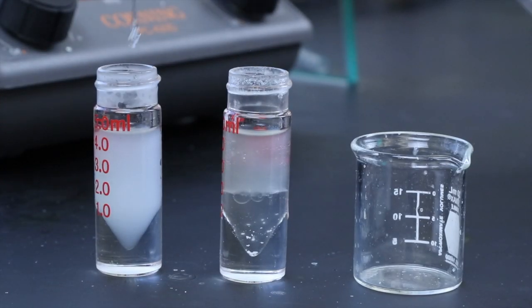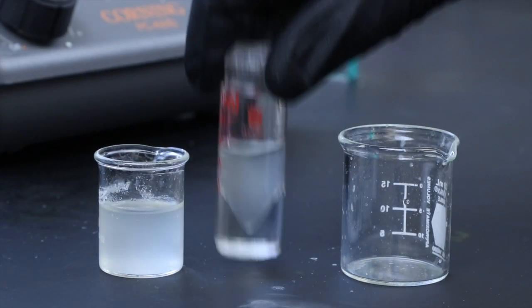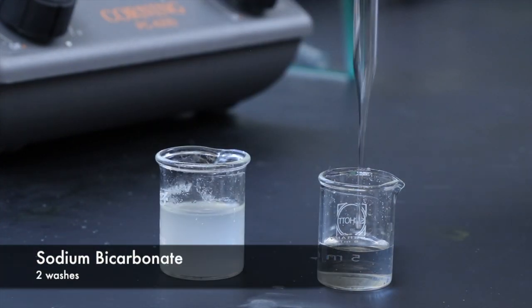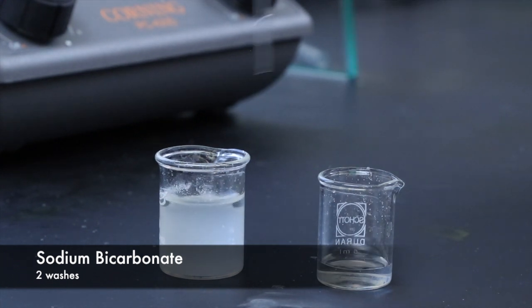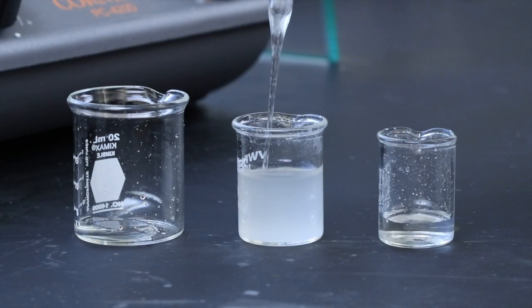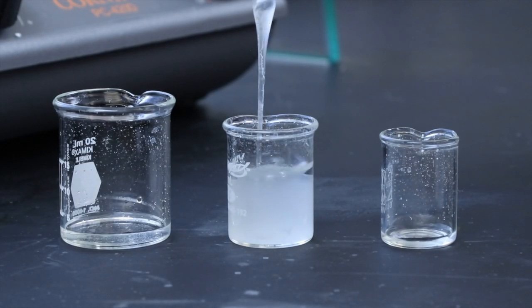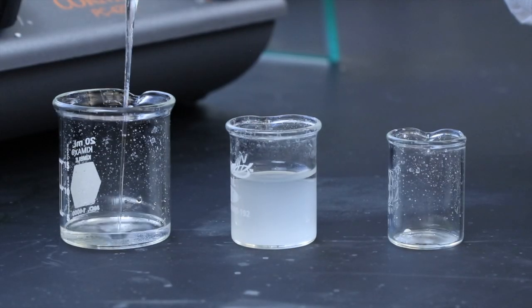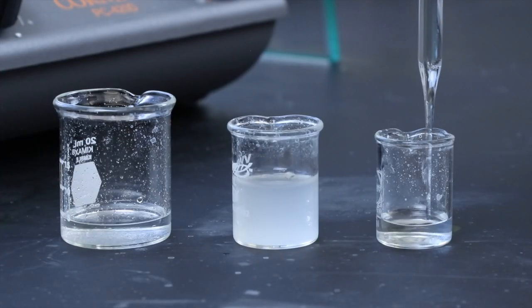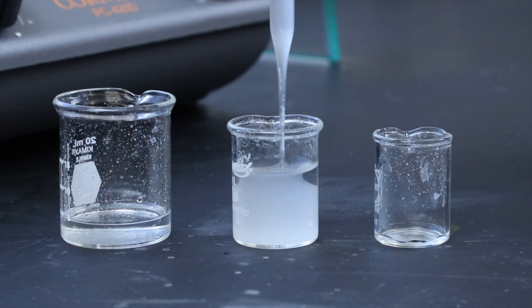I ended up having too much methylene chloride trying to dissolve the solid, so I transferred everything to a beaker. And now I can save the aqueous solution containing the acid product for later and move on to the sodium bicarbonate washes, which I'll be doing 2 of. And then I'll rinse the organic extracts with some distilled water just to help remove any ions that might have been left over from the bicarb washes.